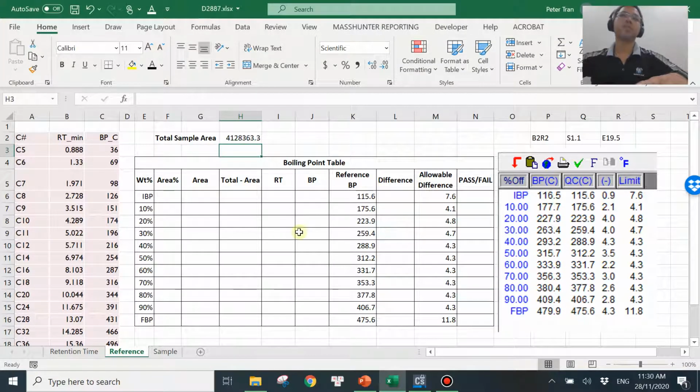So what you need to do is, okay, the next step is you have a couple of different sample amounts over here. The percentage of your sample on this column. Then I have this error percent. So for the sake of this video, I think I'm going to pick only maybe 2 or 3 of them to demonstrate how to perform the calculation. It will be the same for every different percentage over here. So you just need to go ahead and do it on your own. So I pick a couple of them to perform a calculation for you.